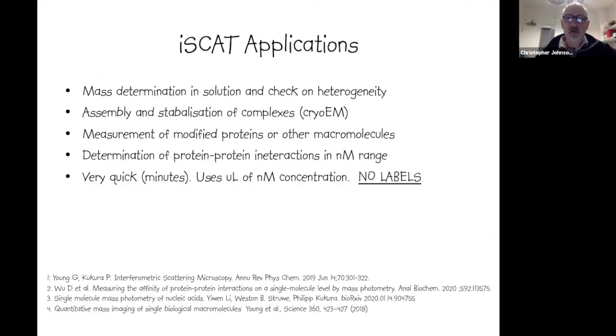And then how do you use this technique? Well, we can look at mass determined in solution and look for heterogeneity of population. We can confirm, which is very useful, the assembly and stabilization of complexes. In particular for cryo-EM work, we can very rapidly confirm that we have the expected mass of a complex before we embark on a cryo-EM session. And we can also try and look for conditions where that complex might be most stable.